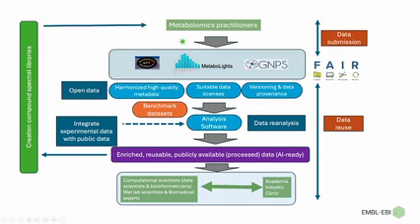At the top are metabolomics practitioners, you. Then we want the data to be submitted into one of the Metabolomics Hub data resources. Again, Metabolomics Workbench, MetaboLights, and GNPS. I will mention this later, but this is by no means a closed club. We are starting this because someone needs to start it. But the idea is that this will be open to any other resources in the future. Someone has to start the framework, someone has to start the work to enable this infrastructure.